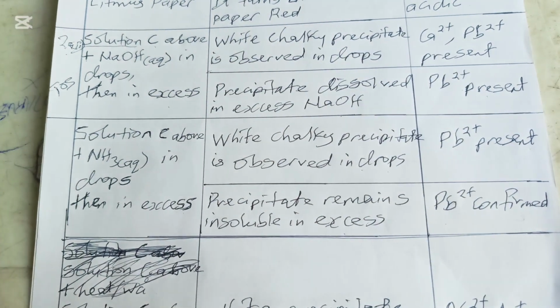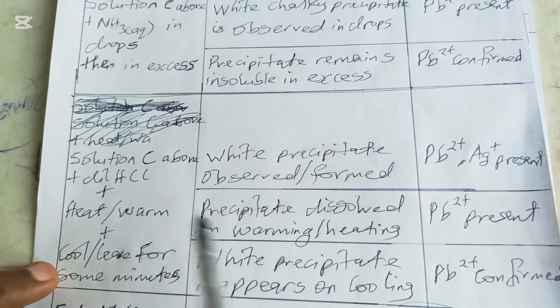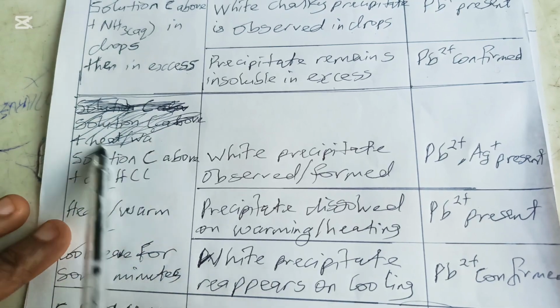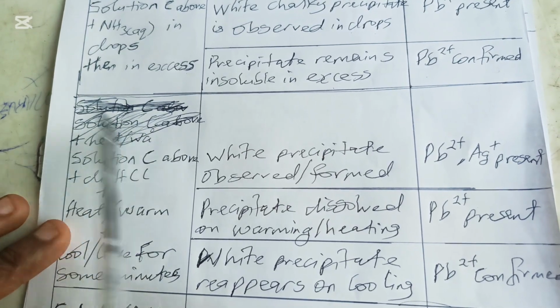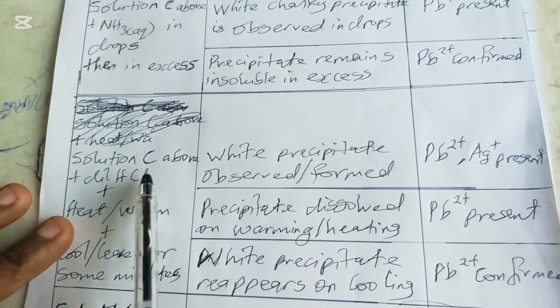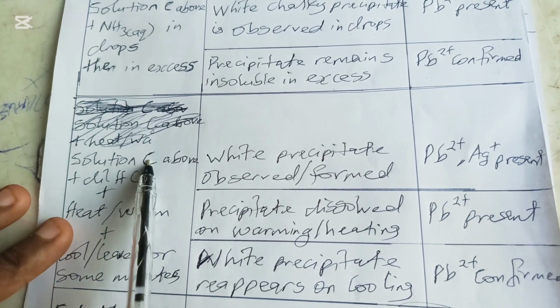Now, the question can come in another format. Very, very important. It can come in another format. I intentionally did this, but please avoid things like this. Sometimes it attracts negative marks. Now, solution C, you can say I'm putting solution. In your question, they might say the third portion. You can put the third, but put the third portion of solution C, please.